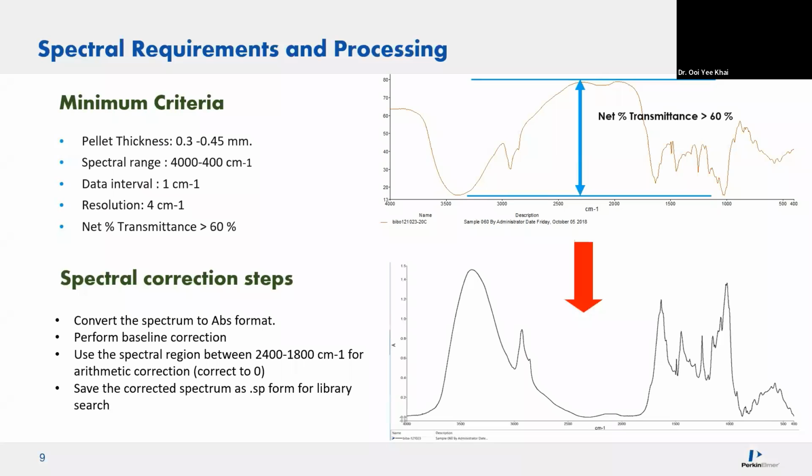For your information, the figure shown here is an example of a spectrum which fulfills the criteria, with more than 60% transmission, and the conversion into the absorbance format. The step-by-step sample preparation guideline is available in the published application notes as well.